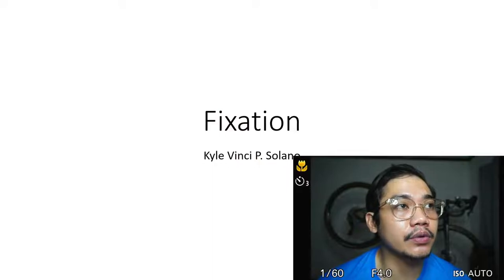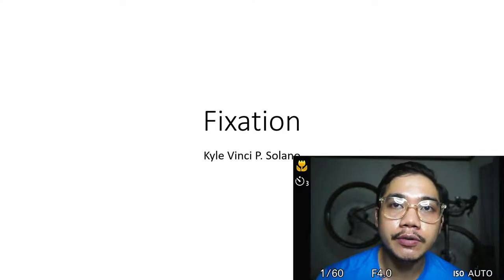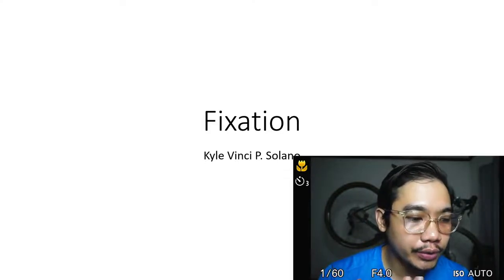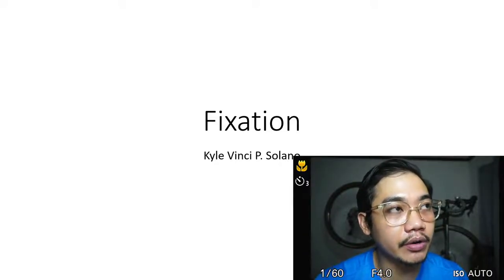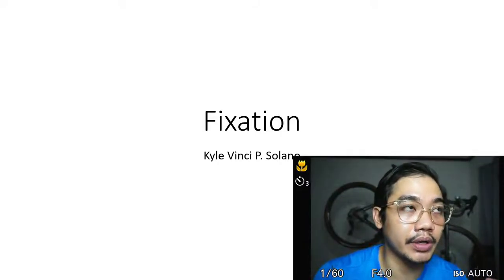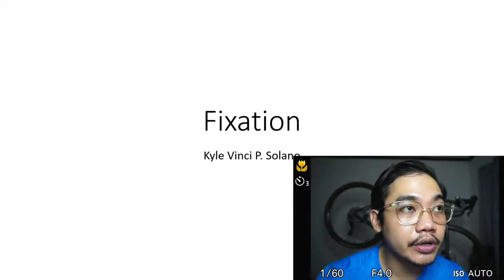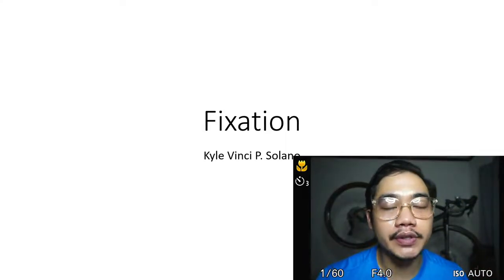Fixation, from the name itself, fixes a piece of tissue at a certain point in time, in which the individual cells of the tissue will not carry out further cellular processes, no? For example, an enzyme or a cell that is secreting mucin, once a fixative is introduced, it will no longer produce mucin. So what happens, there are different types of fixatives.